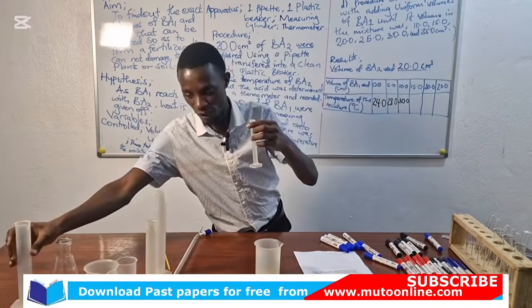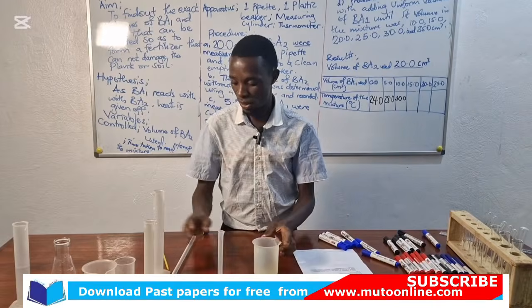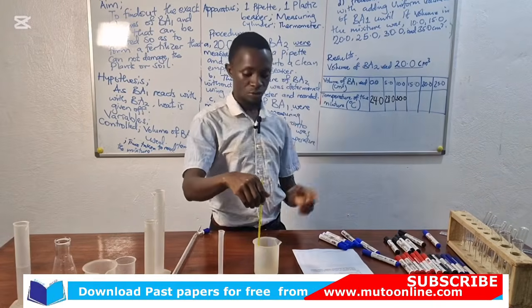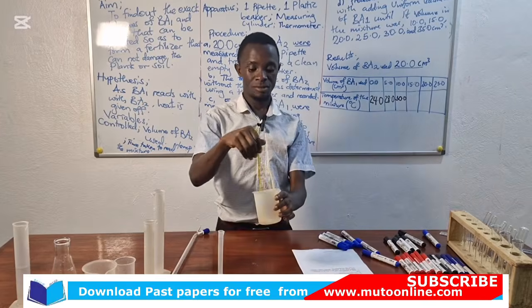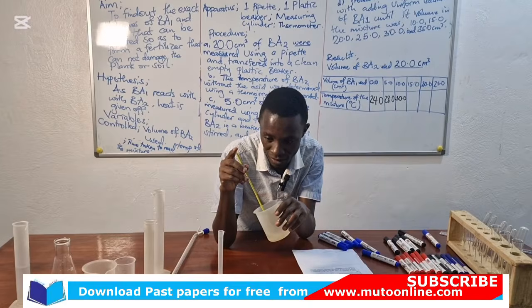But this practical is very simple. So after adding, I stir, so I've made it 15 now. I will stir gently and then give the reaction time to proceed.